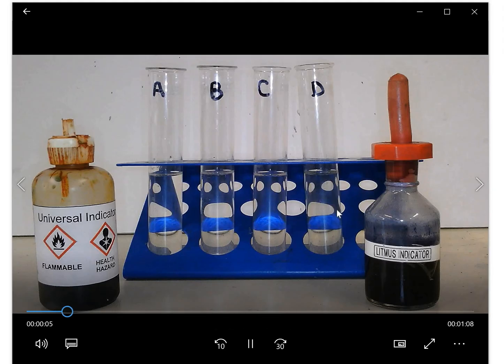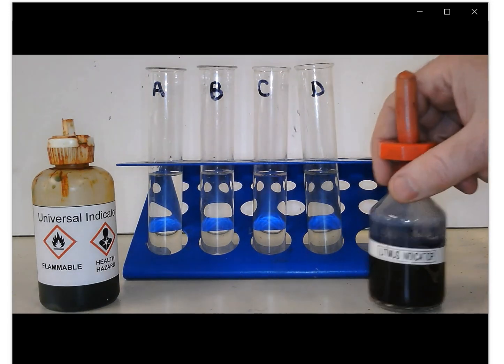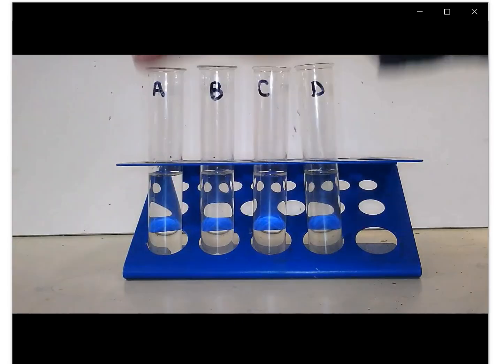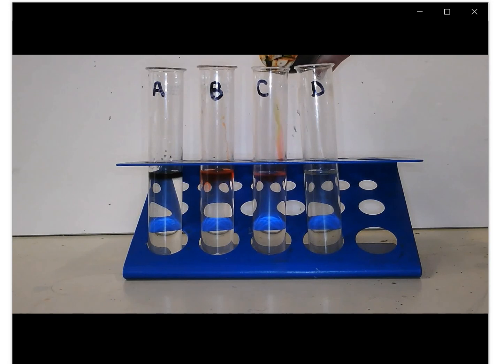so we have our 4 soil samples. We're going to use universal indicator because we need to know more than just is it an acid or an alkali. Litmus wouldn't be able to tell us that. So we're going to add a few drops to each, and then we're going to need to shake them to get it to go through the whole solution.